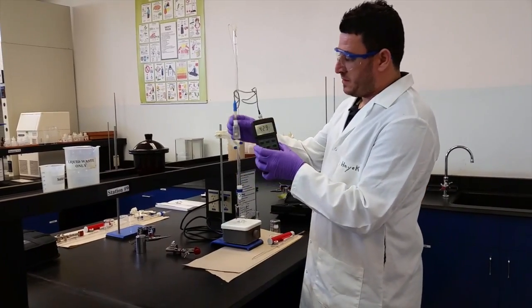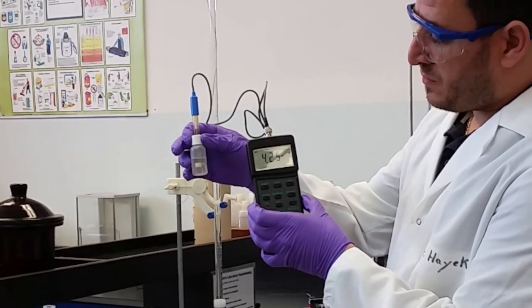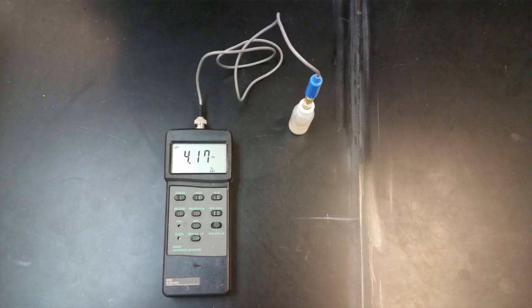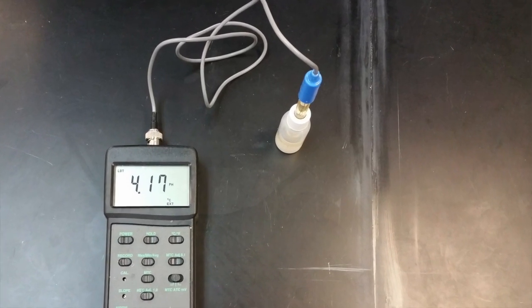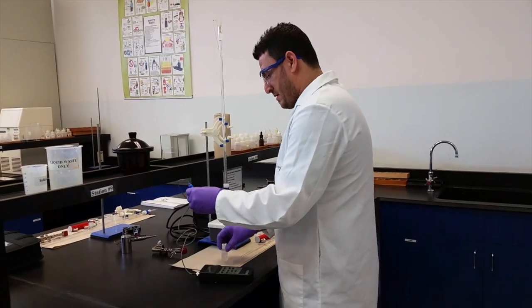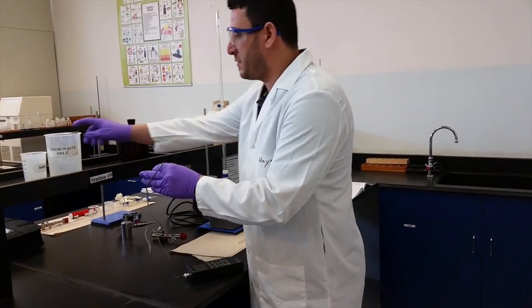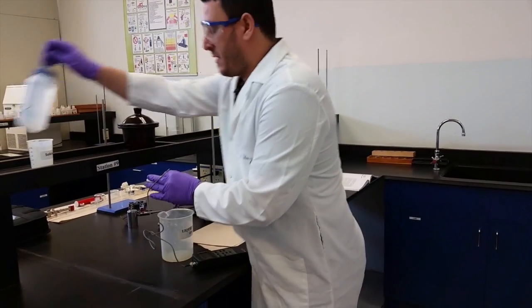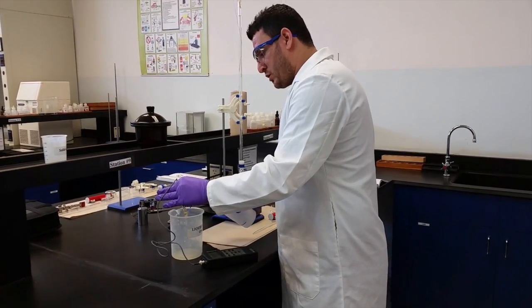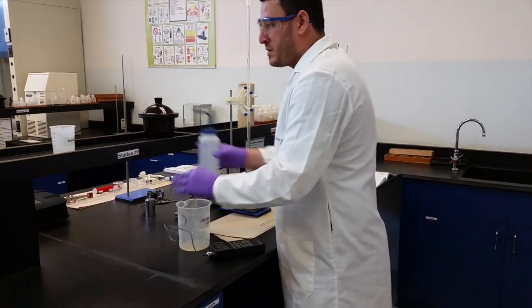So now you can see that this solution here has a pH of 4.25. Okay, it's around 4.2. Now we need to take the probe out of the solution. The tip of the probe is made out of glass, surrounded by plastic, so you have to be very careful when you handle it, okay? Now because the previous solution is not water or neutral, we need to wash it before we use it for our titration.